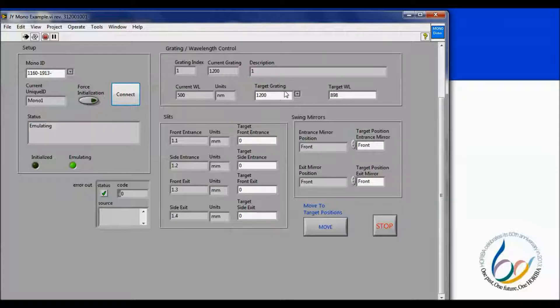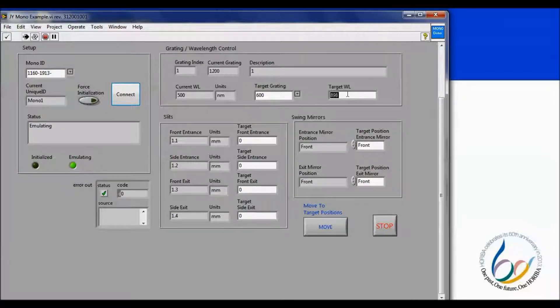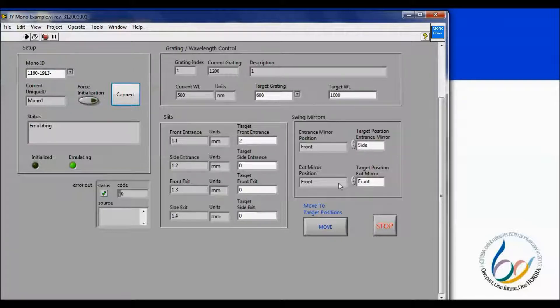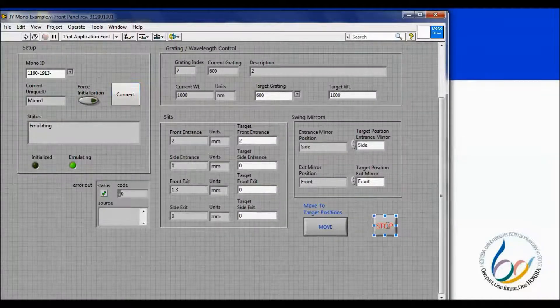If I want to change any of the settings, I input new values in the white boxes and then click move to move the motors to the appropriate positions. The grayed-out boxes are now updated with the new current values. Once you are done with the VI, clicking stop will end the execution.